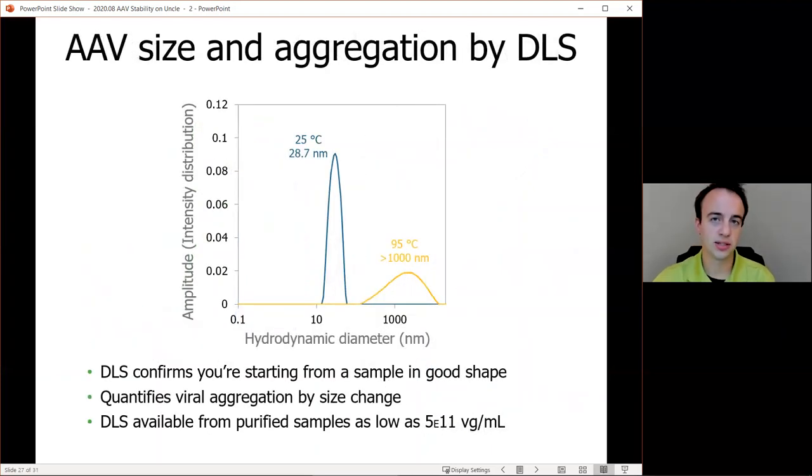Since we also do DLS reads during our capsid stability runs, we can get information on if your capsid during this experiment started as a homogeneous monodispersed capsid or if it was suffering from aggregation issues already at the start of it. You can also confirm at the end of the experiment that sample aggregation has occurred.